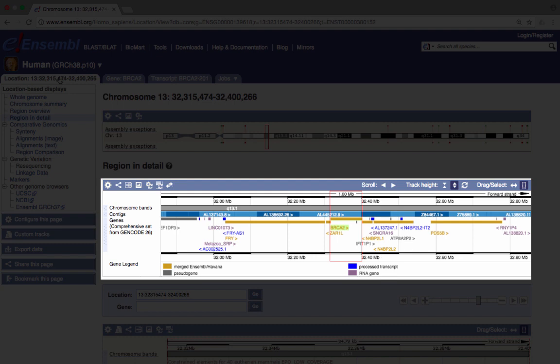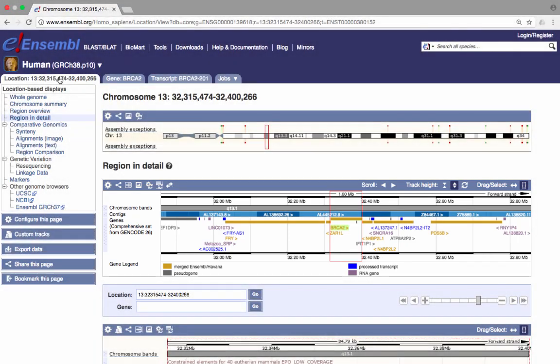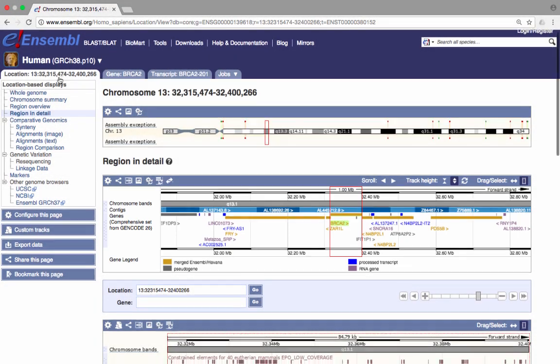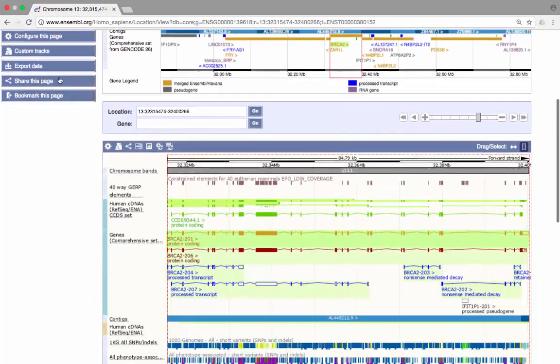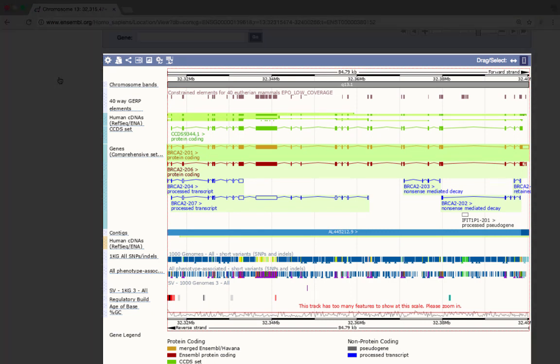Contigs are shaded in light or dark blue to show their position along the genomic sequence. You can click on a gene, or click and drag your mouse to form a small box to re-center the display. Scrolling down, we are able to see the third, most detailed depiction of the BRCA2 genomic location. The data is displayed in individual tracks, which can be formatted, moved, added or removed.